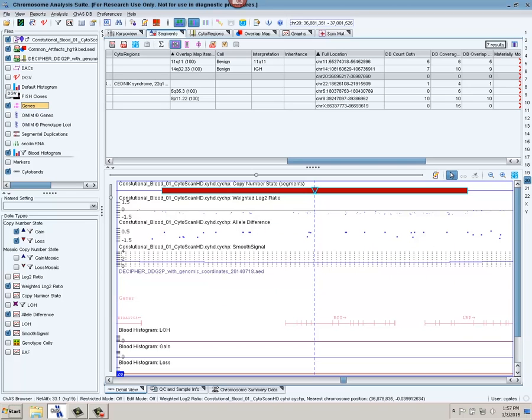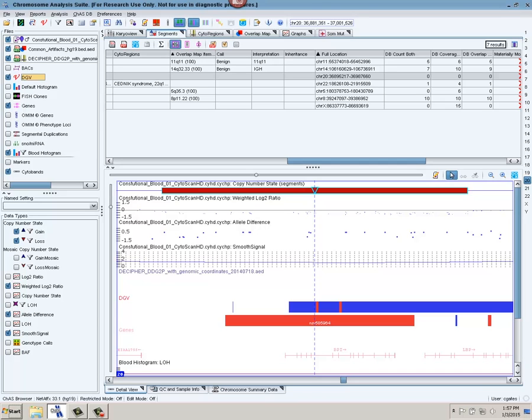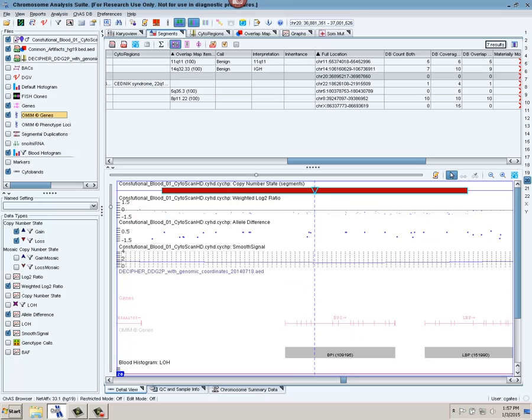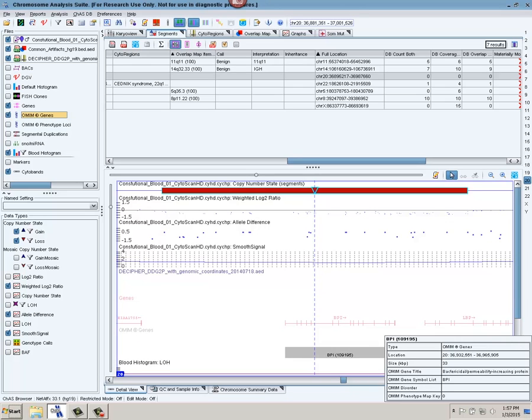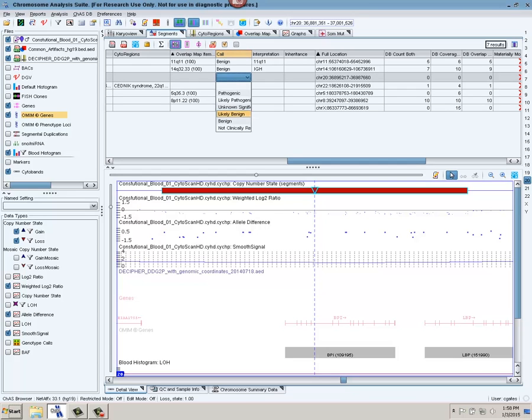I can look at the database of genomic variants to see if there's any overlapping genomic variants. There is one. It doesn't overlap the entire length of my segment. I can also look at the OMIM genes. I can see that there have been some OMIM genes. I can then link out externally to UCSC and NCBI and Ensembl to look in the literature to see if these particular genes might be clinically relevant for my particular sample. In this case, I see that there is no phenotype associated with these OMIM genes. So I'm going to say that this is likely benign.